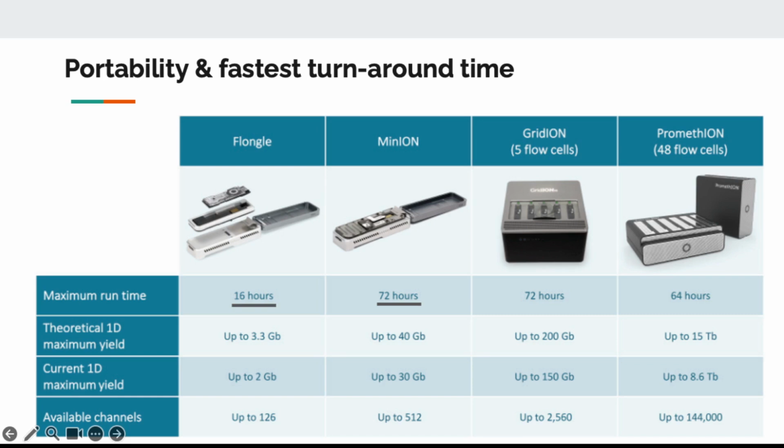So that means you can do sequencing not only off-site, but you also don't need to invest a lot into the machine. You might need to spend millions of baht to buy an Illumina or PacBio sequencer, but each small scale nanopore, I think, is on the scale of thousands or 10,000 baht. So you can start your sequencing project with low overhead costs.